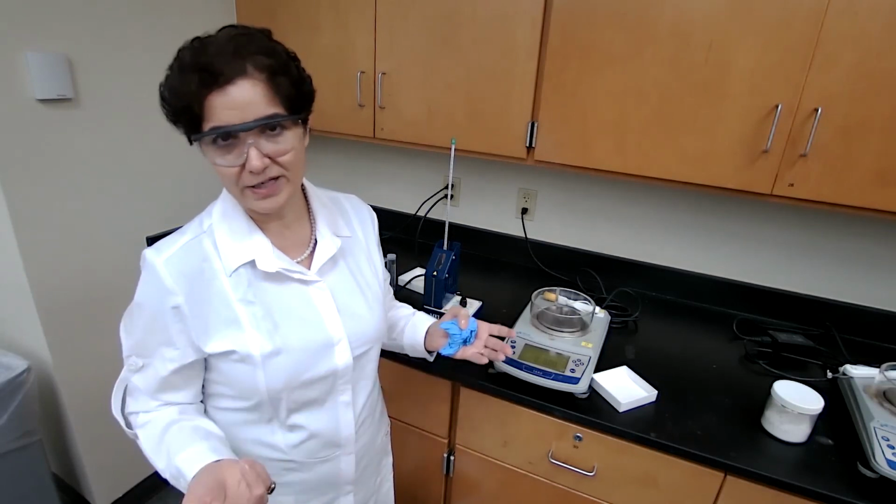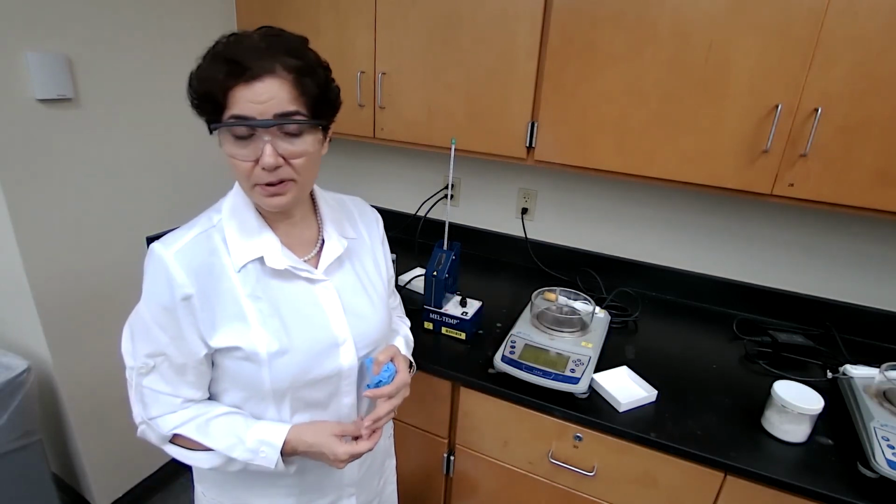And if the melting point is close to the literature value, you have a pure sample. That means your extraction was done properly and the extraction method is effective.